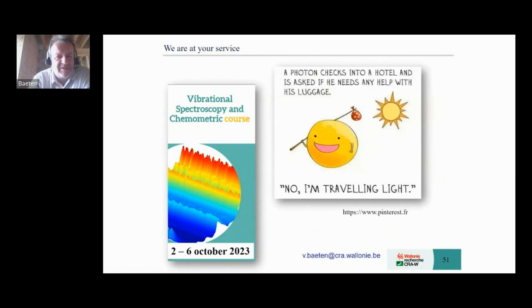Okay. So the main application for the time being, I would say, is in feed, so alimentation for animals, where it is used daily to assess the quality. And also I want to mention milk analysis, where we use the mid-infrared daily all over the world in order to assess the quality of milk and to pay the farmer regarding the quality of the milk they produce. This is, I would say, the two biggest applications.